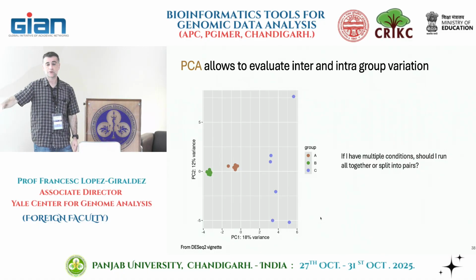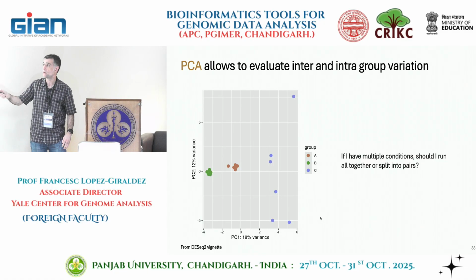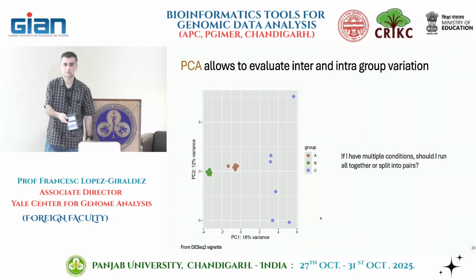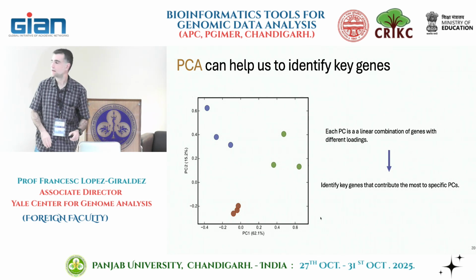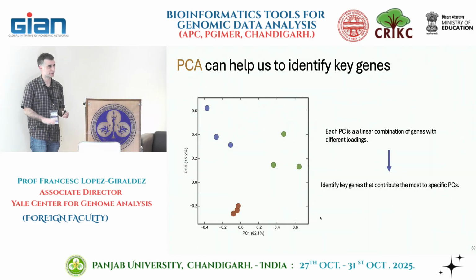But you can have situations like these, and then you need to make decisions on how you analyze your data, because one of them is going to throw off the statistical analysis just because the intervariability within the data is too high. So we will not get significance in the data. You're going to get a lot of problems with that. And we can talk about the problems too if we have time.